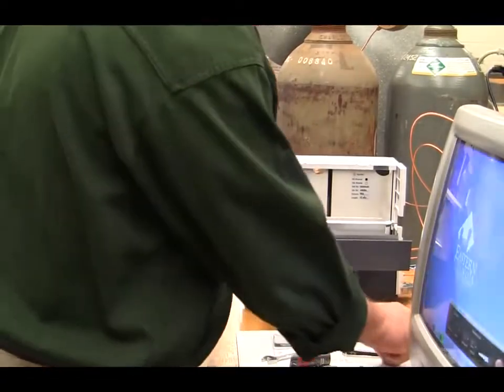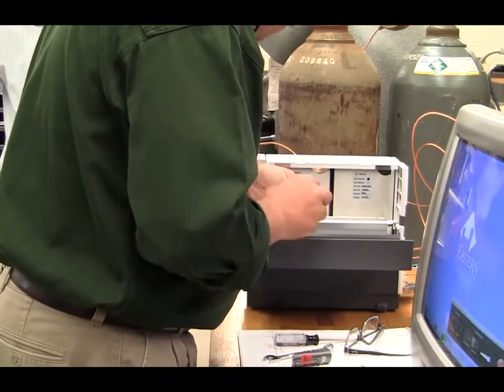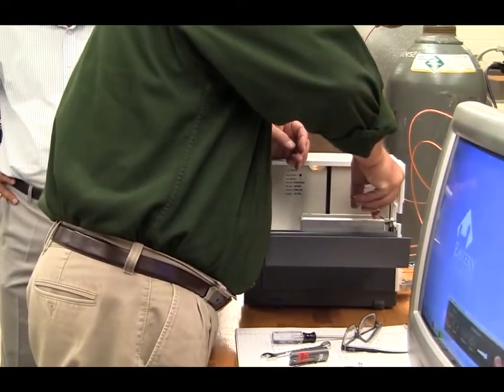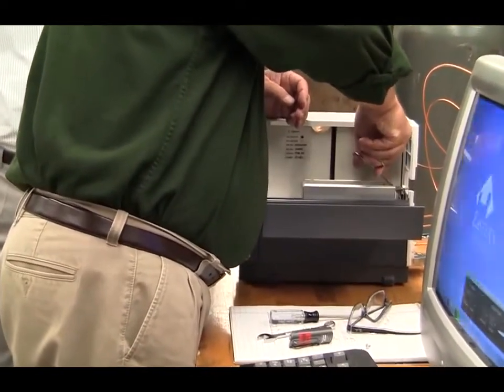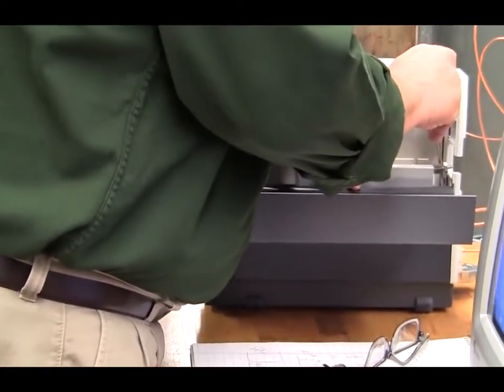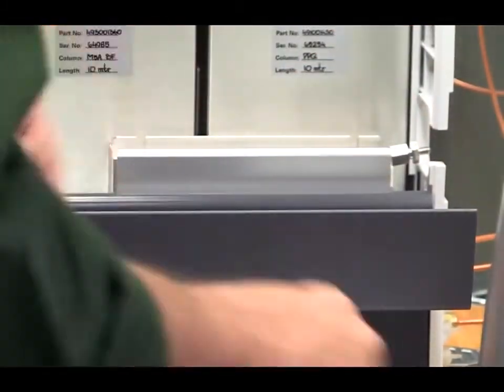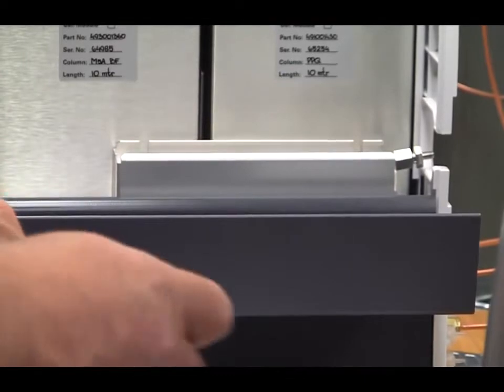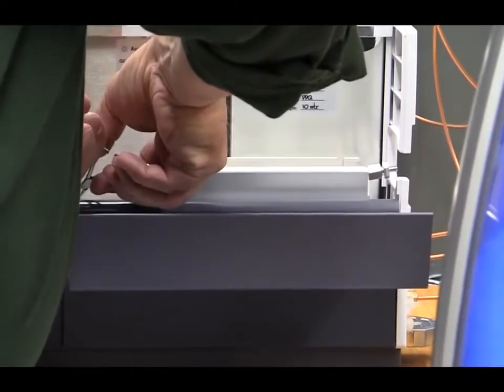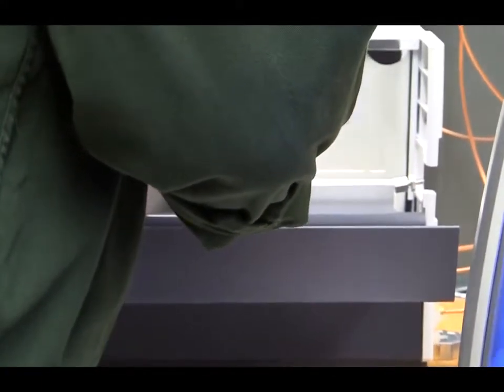All goes back together. I have a tendency now to drop these little screws inside of the cabinet and then have to take it all apart again, so I don't want to do that anymore.